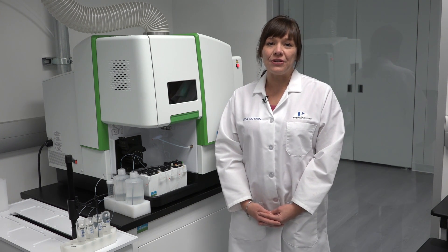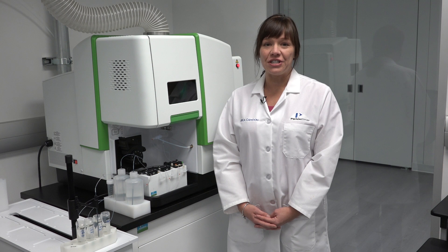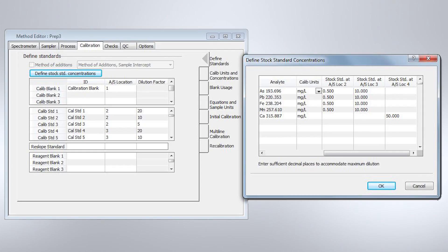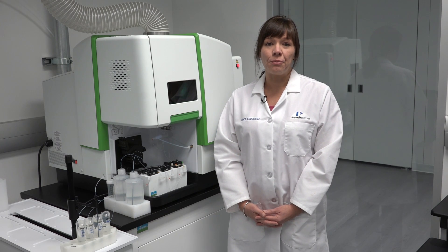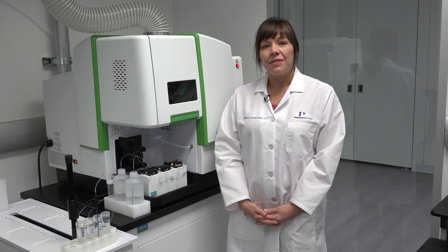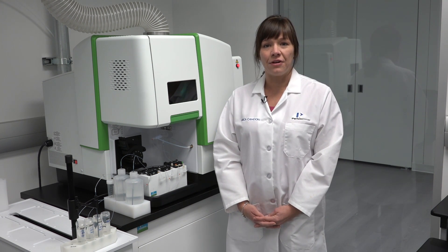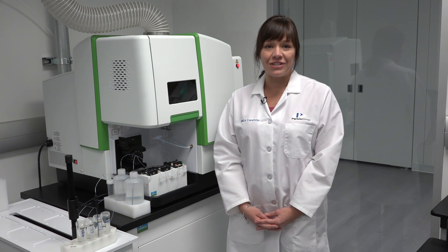These PrEP3 features are fully integrated into the Syngistics ICP OES software. In the software, you will list the locations of the stock standards, the dilution it needs to perform in order to achieve the desired concentration, and the concentration of the stock standards. Now the PrEP3 auto sampler will prepare the calibration curve. These concentrations are dependent on the concentration of your stock standard and the dilutions you select, so you can make these concentrations higher or lower to fit your application needs.